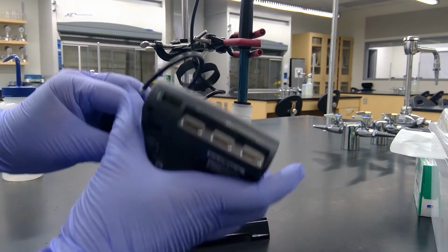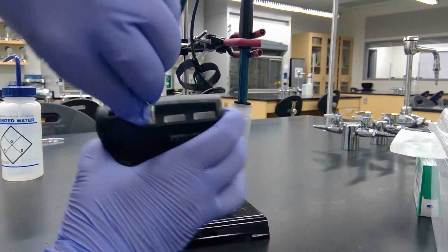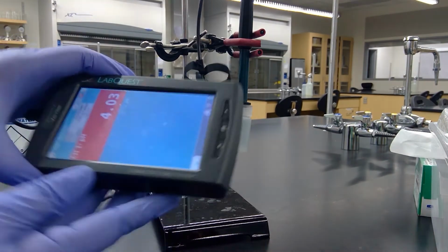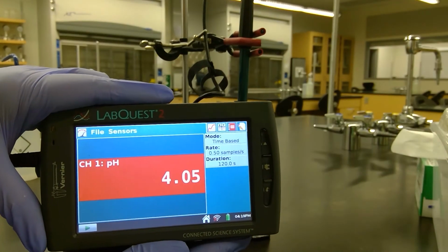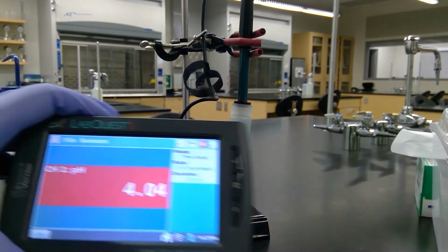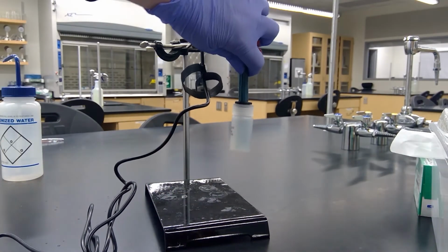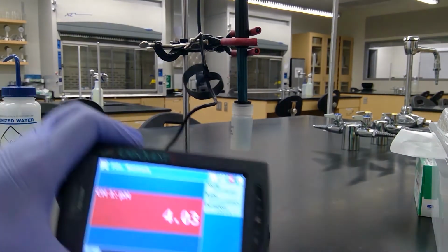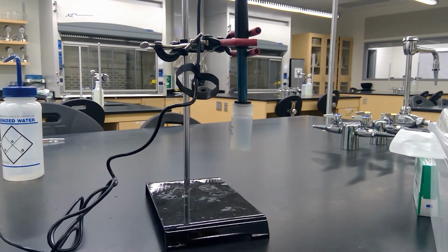So you attach it to channel 1, and then it recognizes that it's a pH probe and tells you the pH. So, and that is pretty close. The solution that it sits in is supposed to be pH 4, so hopefully we'll be doing pretty good.